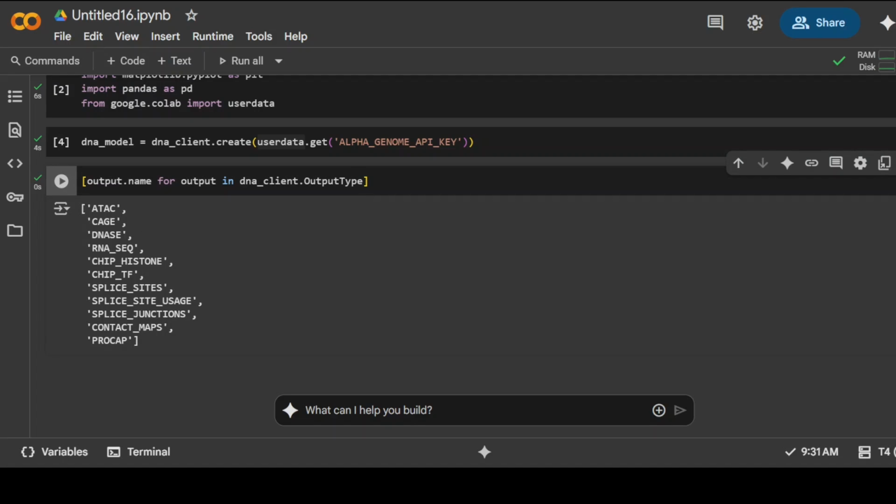You see, so this is something called output metadata. Now this is what AlphaGenome primarily supports. So it can make predictions from DNA sequences, and these are the output types it supports. Now I will be honest, I have really no idea what exactly they mean, but some common search tells me, for example, that this RNA-seq is an expression that is measured by RNA sequencing, and it includes a mixture of something called poly A plus RNA and total RNA assays, and there are some stranded things and then some of the non-stranded things.